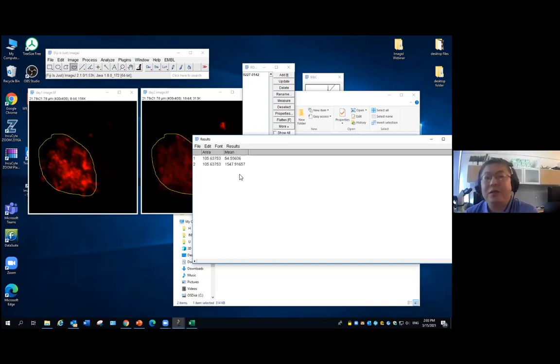Sometimes you're interested in comparing the intensity change in, maybe, a live cell. I wait for 1 day, I add some stimulus to the cell, and the intensity changes. But sometimes this is kind of too much. Actually, here the change is not related to a real signal change. It actually depends on how you measure, how you take the picture.